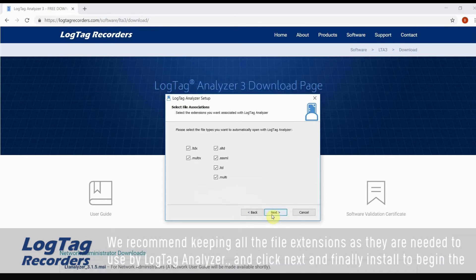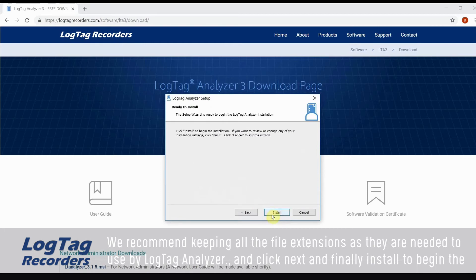We recommend keeping all the file extensions as they are needed to use by LogTag Analyzer and click next.